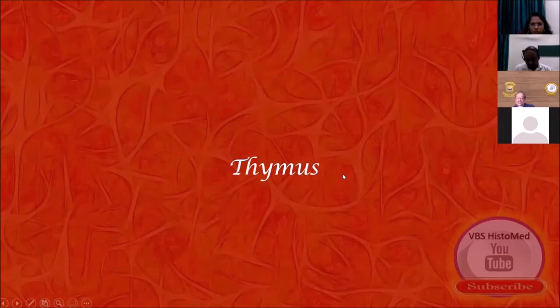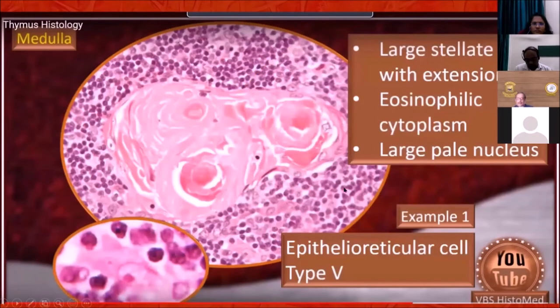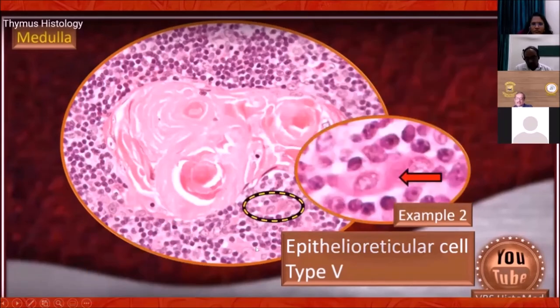Thymus — again cautioning and redirecting students' attention to another very interesting slide. In most of my lectures I present Hassall's corpuscles as some kind of cyclonic storm, but beyond Hassall's corpuscles, there are very specific cells that can be identified around them. Here I have highlighted in a bigger circle one type of epithelioreticular cell, and there is yet another epithelioreticular cell also visible.